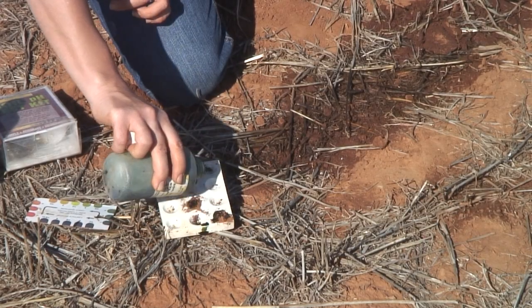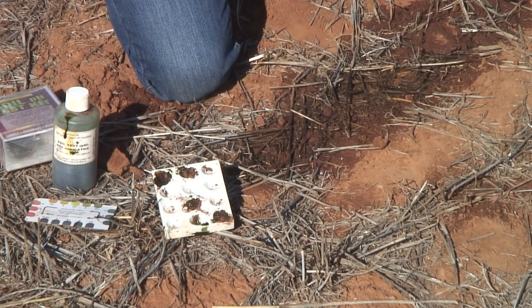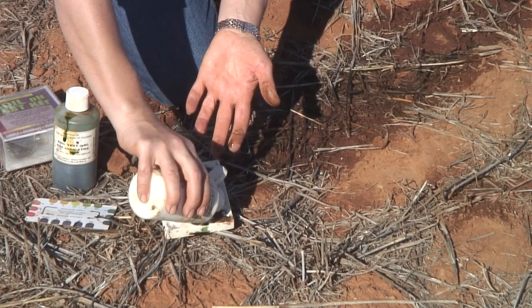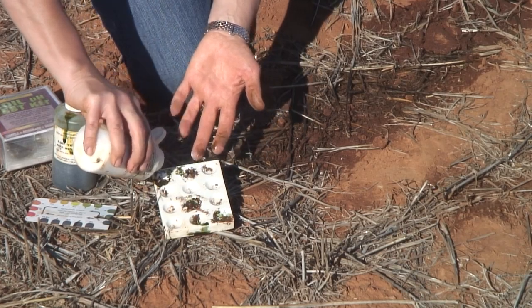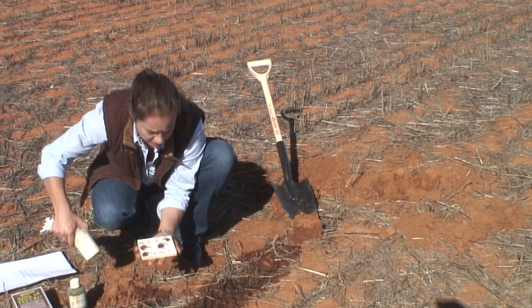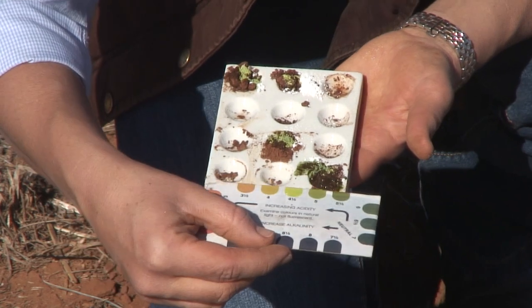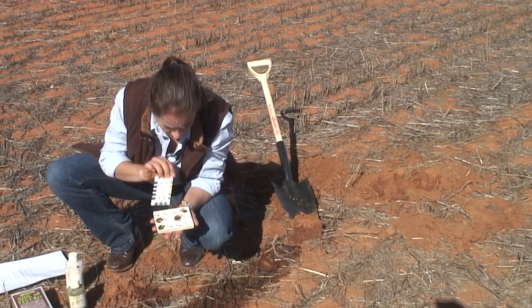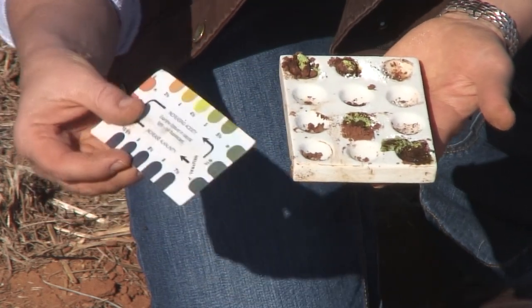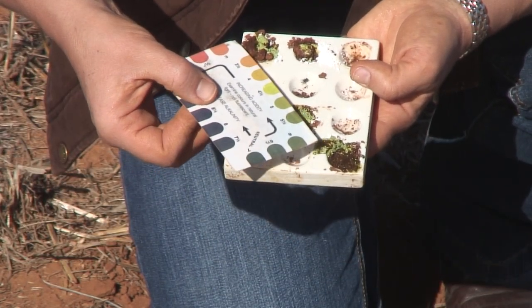I'll put a couple of drops of reagent onto the soil, then we use this white powder simply to show the reaction in a more visual sense. Now the soil has reacted with the liquid and the powder is showing the colour reaction. Using one of these simple indicator cards, we can determine the soil pH. The more acid a soil is, the more green or yellow the reaction will be; if it's alkaline, you'll see a much more purple or grey reaction.